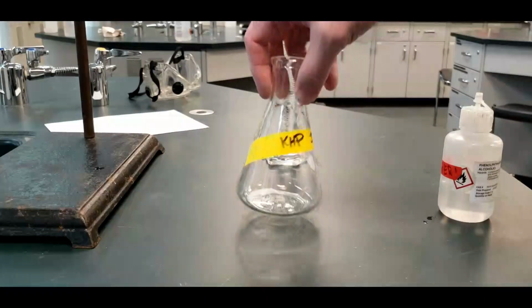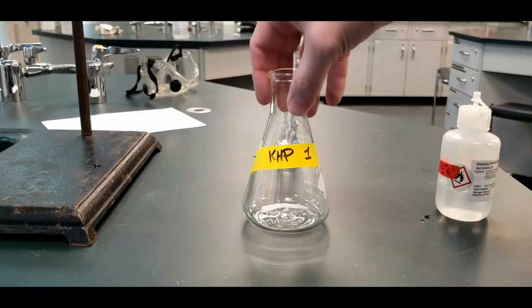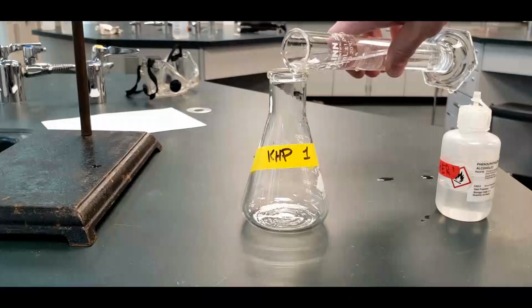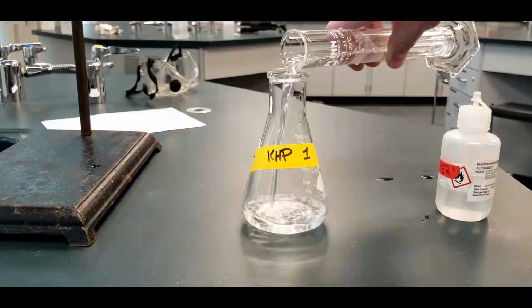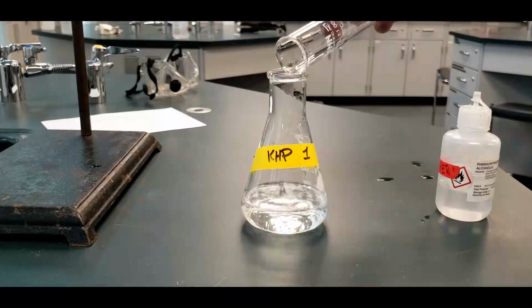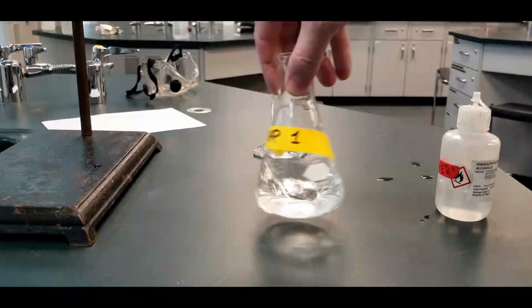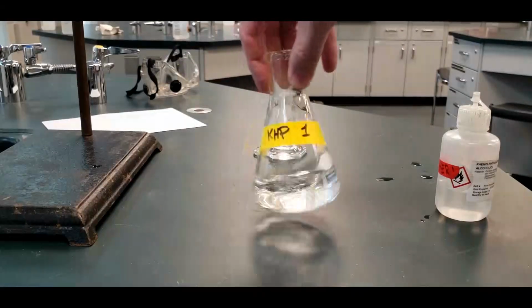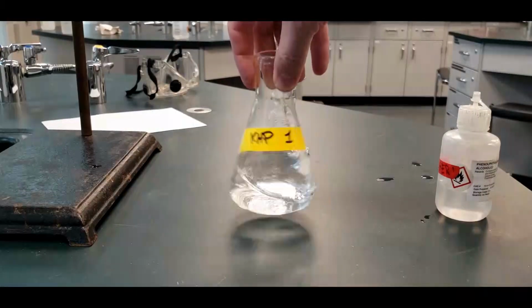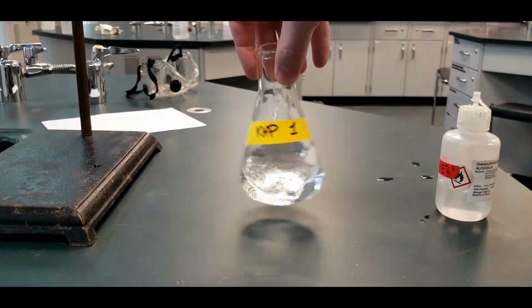All right, so I moved the KHP into a larger flask here. I forgot that for this one, we need 75 mils of distilled water. You need so much water because we need to dissolve the KHP. And it takes a little bit of effort to do that. Let's swirl this around. If you don't get all the KHP in, as you titrate, as you swirl, it will go in, but there's a chance that some of it will remain behind.